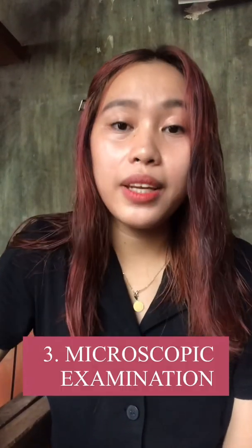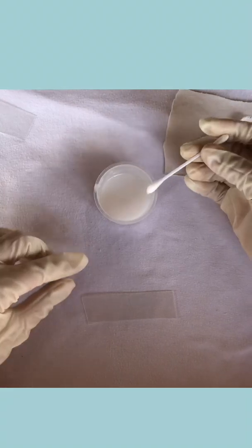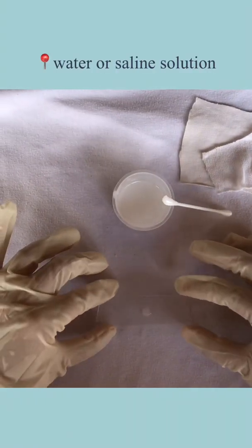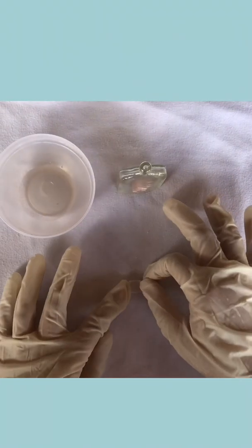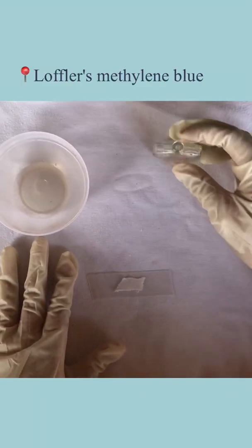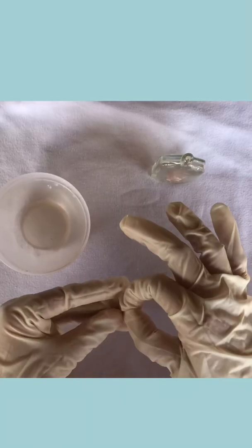The third examination is the microscopic examination of semen and seminal stains, performed to determine the presence of spermatozoa. For fresh semen, transfer a drop of specimen to a glass slide, add a drop of water or saline solution, and cover with a cover slip, then examine under the high-power objective. For stained smears, place material on a slide in a drop of water, allow to dry, stain with Löffler's methylene blue for a minute, wash with water, dry, and examine under the microscope.